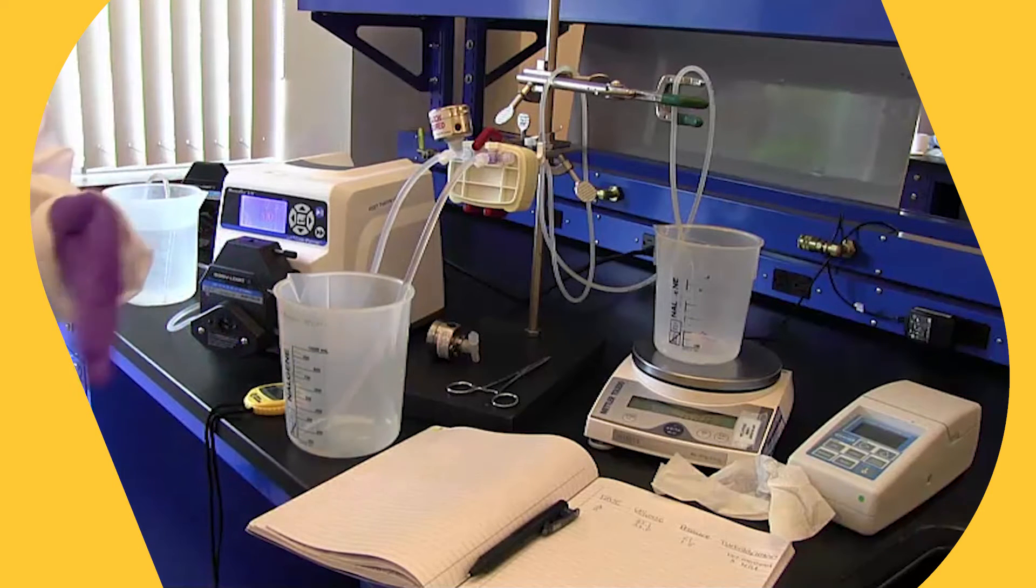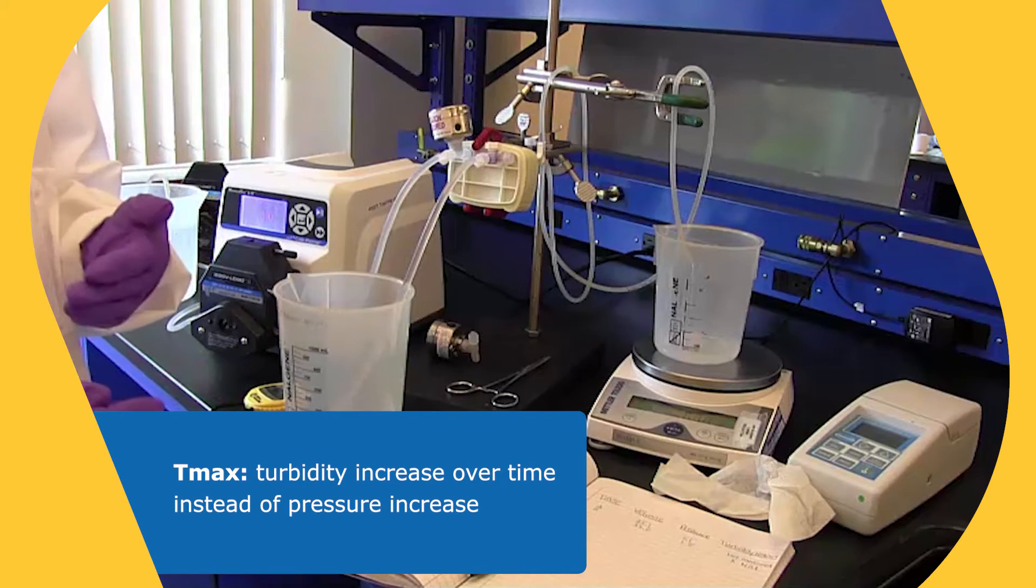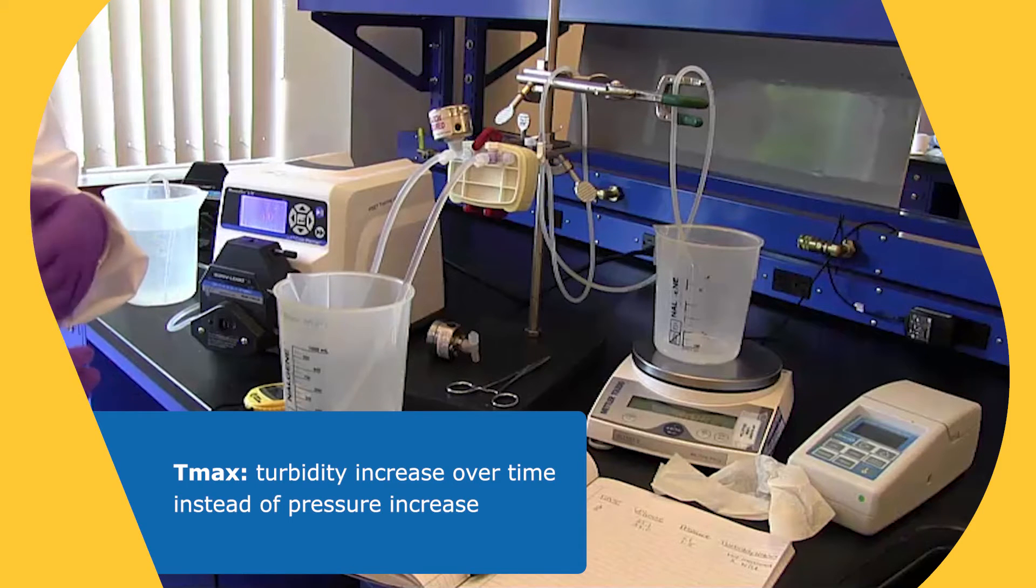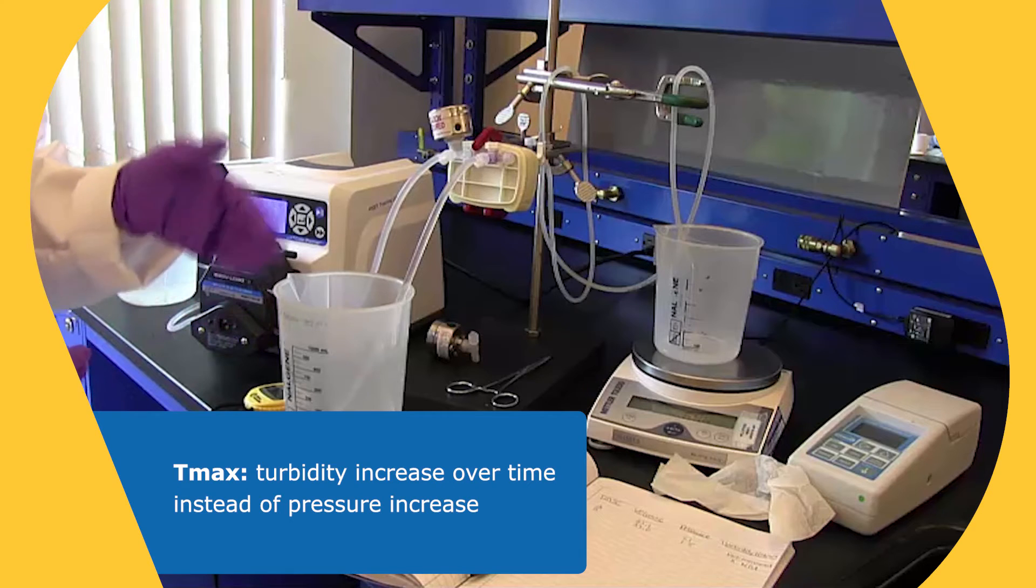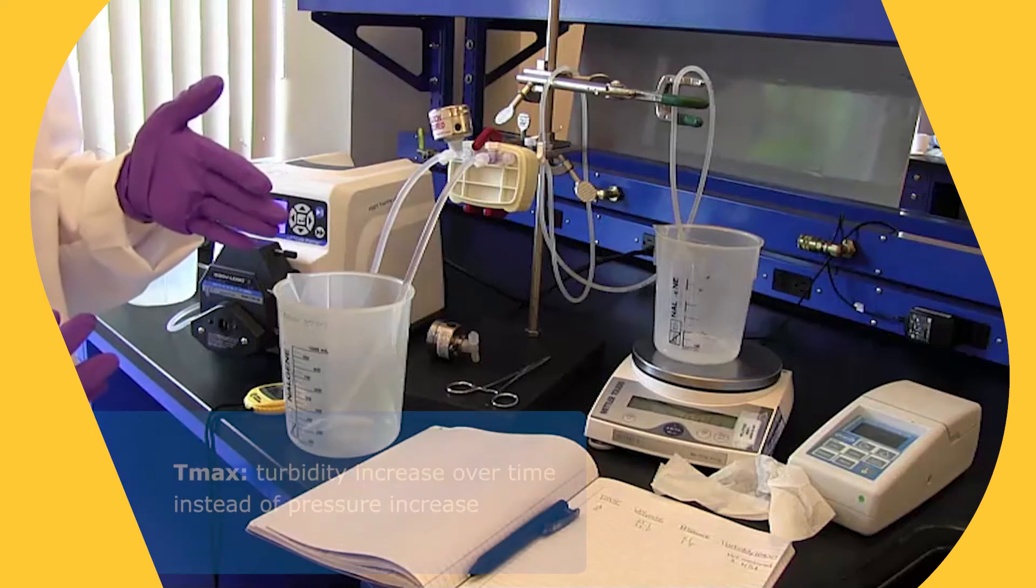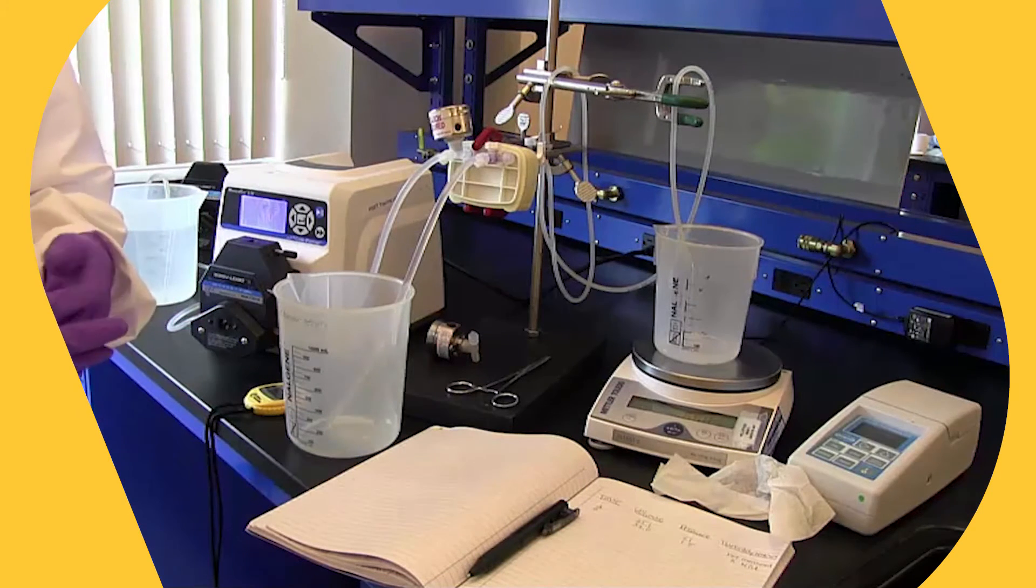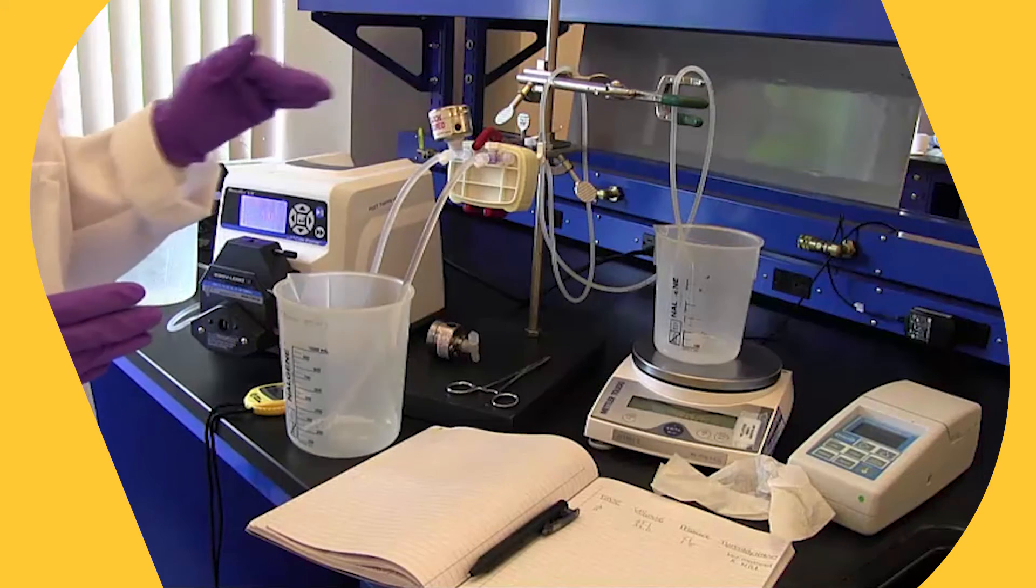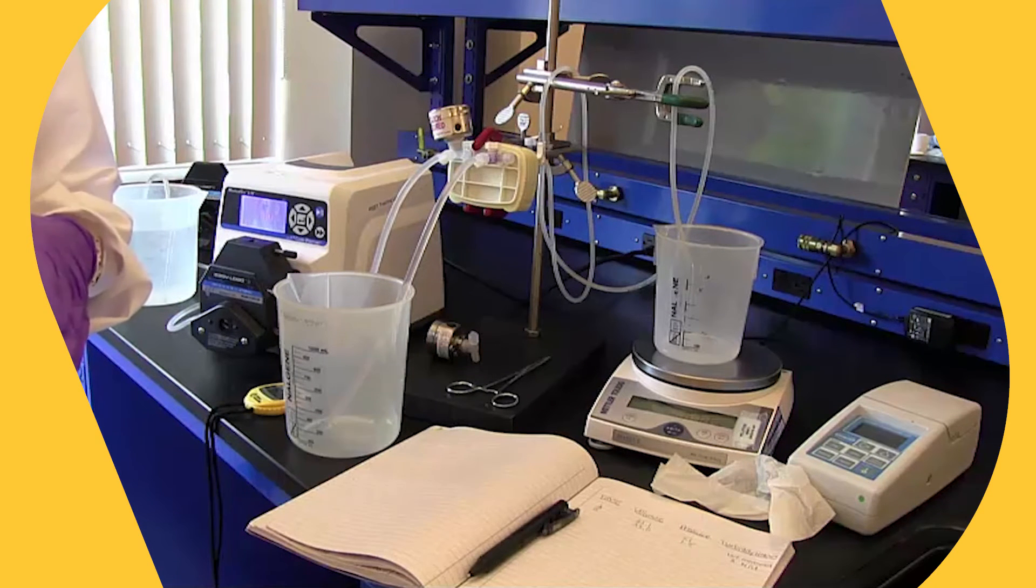So when that happens, it's actually sometimes referred to as a T max, so like a maximum turbidity. Or you've reached a point where, depending on the kind of particles and the size particles and the pressure, you're having what we call breakthrough. So the particles, instead of being captured by the depth media, are now breaking through and causing cloudiness on the downstream. What that says to us is if this is the right filter for you, you need to size it before that breakthrough. So whatever volume to area ratio you were at at that point, that would be what you use to translate to the large scale.